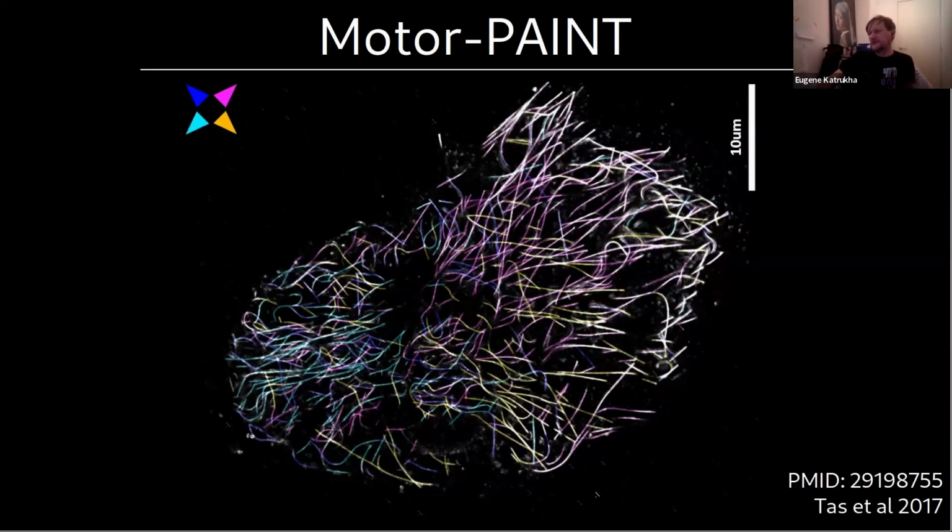I call them microscopy friendly cells. These are 2D cells which are grown on a flat surface, so it's very handy to image them with a standard illumination. And you can see that in this case we have this map and it's mostly radial. The colors here correspond to the direction of the movement. This is the center of the cell, and on the top right, most of the traffic goes from the center, like the purple arrow is showing.